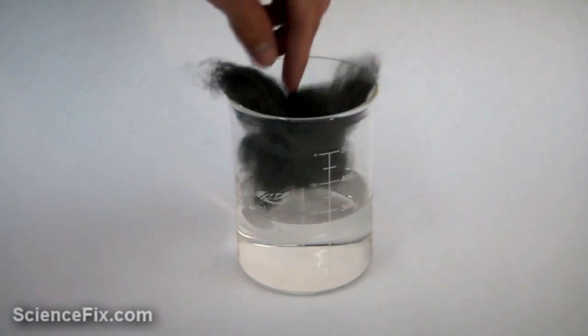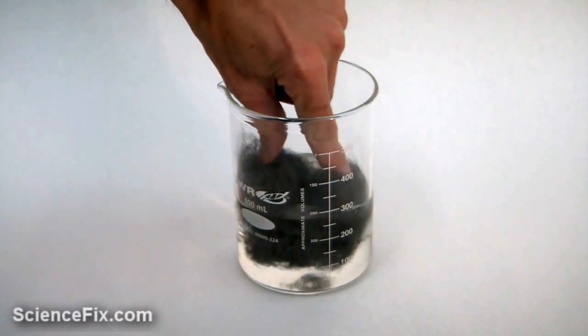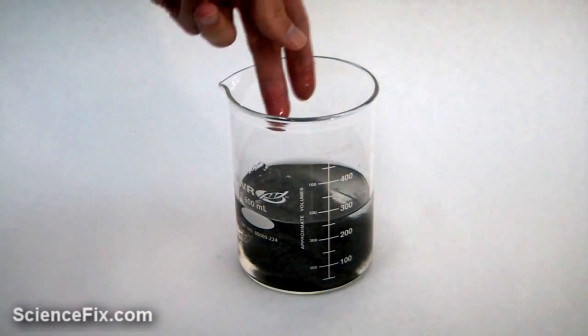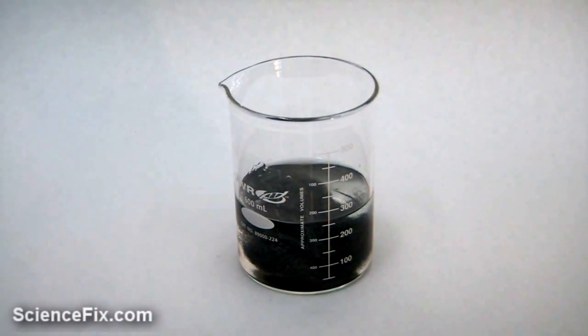The steel wool is being placed into a beaker of vinegar. The vinegar is going to strip away some of the wax that's covering the steel wool, and it's also allowing the steel wool to be exposed to oxygen in the atmosphere a lot easier.